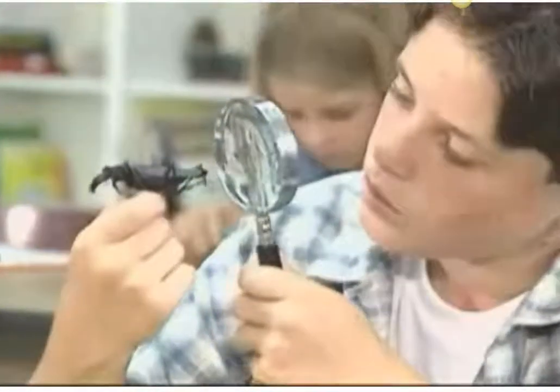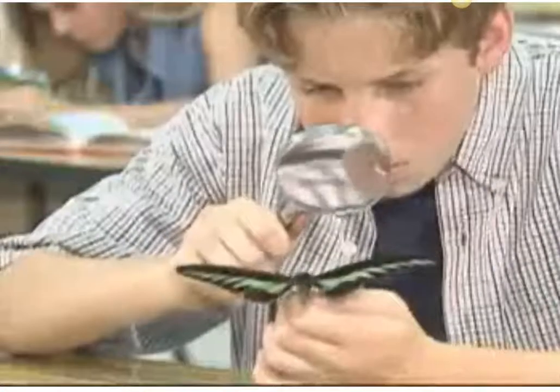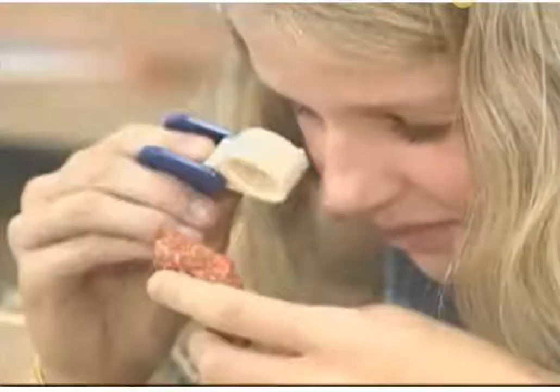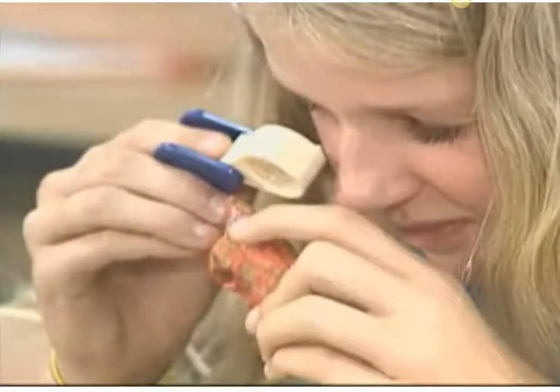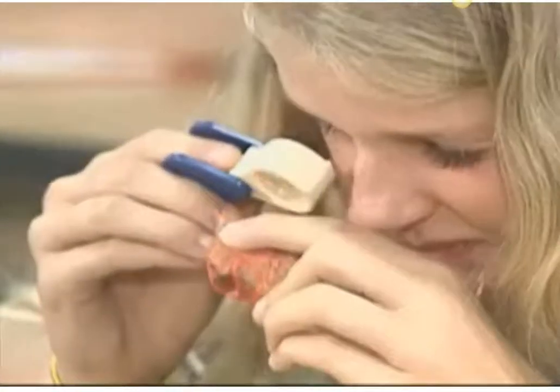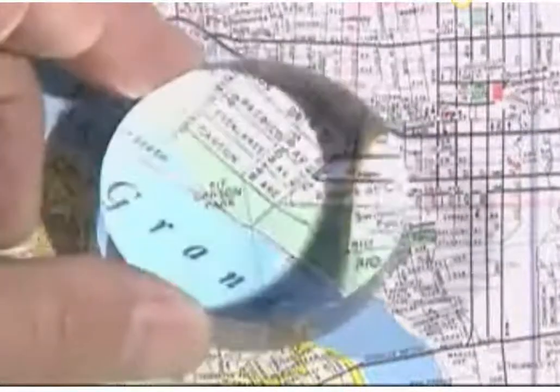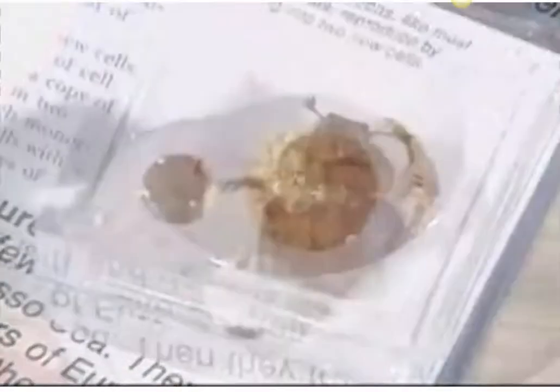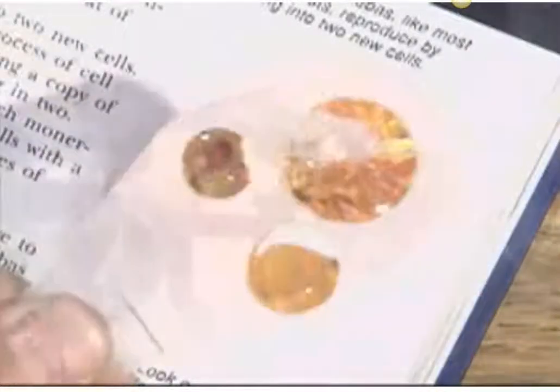Its power is 3. It is meant to be placed a comfortable distance from your eye and adjusted until the specimen comes into focus. Other magnifiers are meant to be placed very close to your eye. These usually have a smaller diameter and a greater magnification. Some magnifiers are meant to be placed directly on top of an object. Others are part of containers. And still others offer a choice of lenses and magnifications.